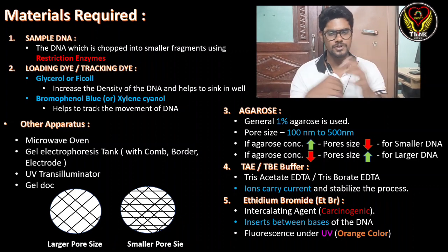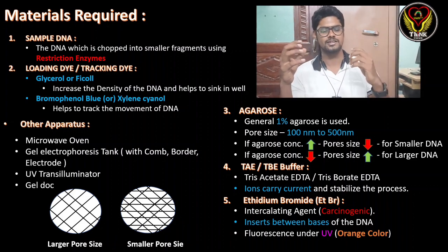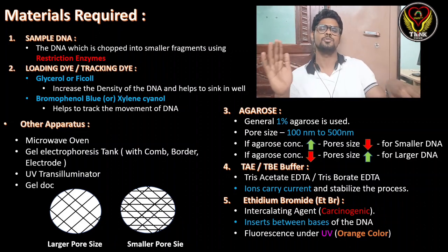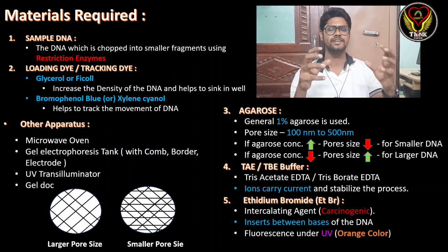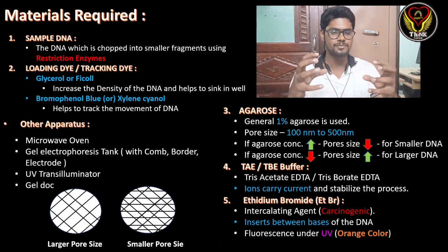Coming to the fourth important thing, TAE or TBE buffer. The buffer is used to stabilize our process. So for DNA to move from the negative electrode to the positive electrode, these buffers will be helpful. TAE means Tris acetate EDTA, and TBE means Tris borate EDTA. So these are the important buffers.